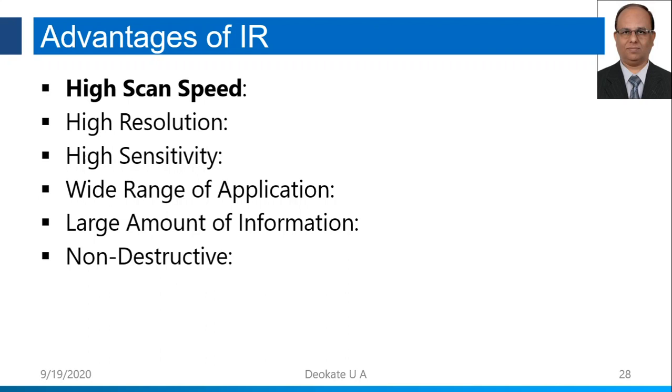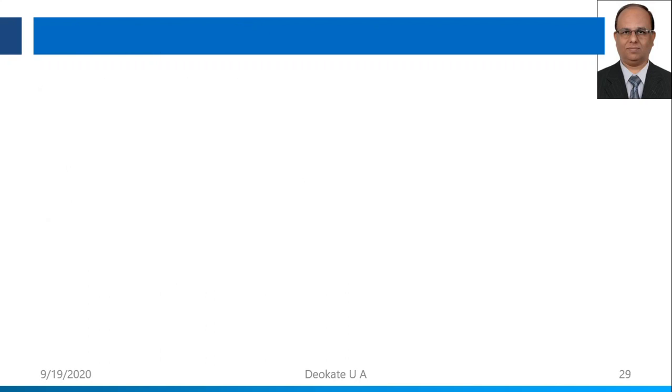Another application, it is a non-destructive method. When the sample is very costly and we don't want to waste our sample, we can go for infrared spectroscopy because it is a non-destructive technique where we can preserve the samples or we can reuse the sample.